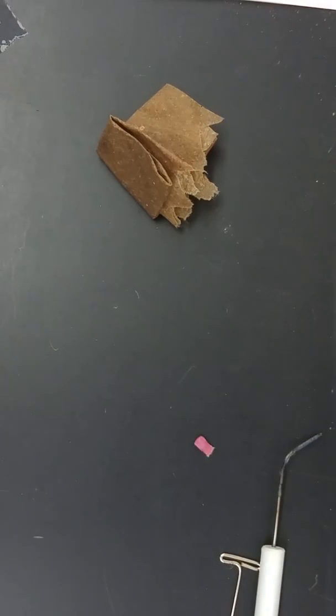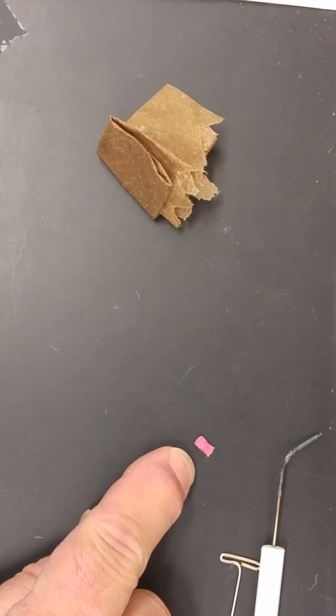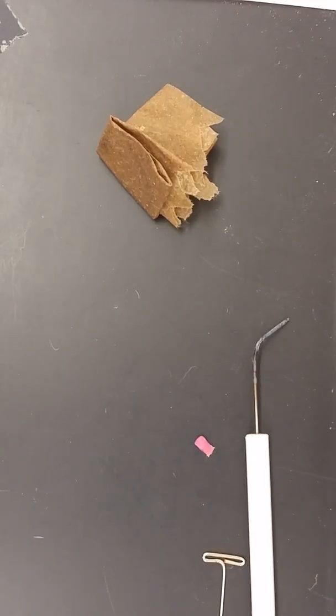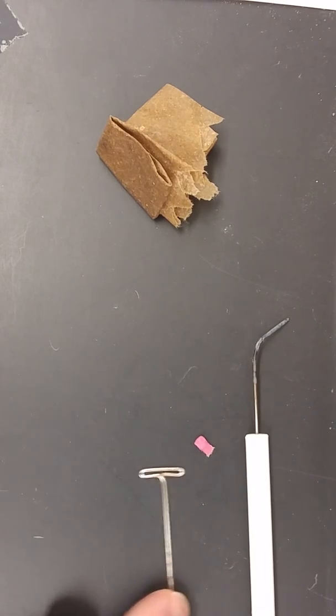Welcome to the first video series on how to get a finger infection in science. Today you are going to attempt to place a match head on a pin. You have two choices: a dissecting probe or a dissecting pin. Either can be used.